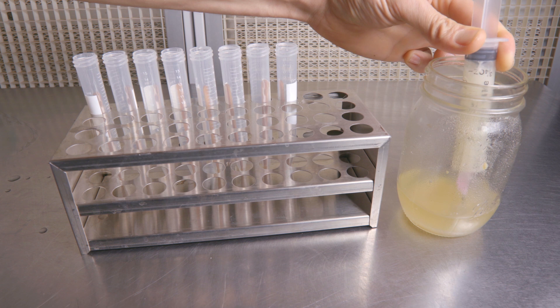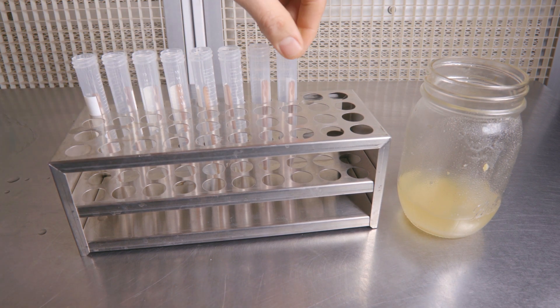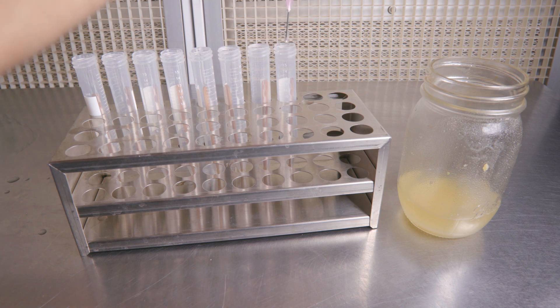This step must be done in front of a flow hood or in a still air box. But if you don't have either, you can pre-fill your slants and then sterilize them. Just keep in mind that the pressure during the sterilization cycle may cause your media to boil out of your slants.